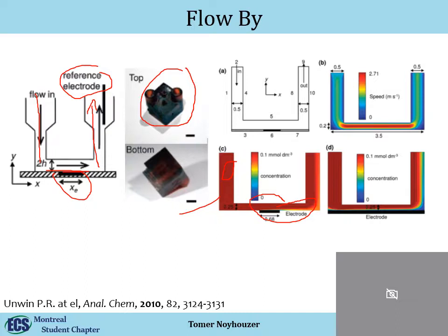Most of the system is actually red. It's dead volume. It's just a waste. If you increase the electrode, so it will be the entire area, but again, increasing the electrode means that you have to pay more for an electrode, especially if it's platinum. You can see that it has much more blue here, right? Because you increase the active surface area, but you still have dead volume.